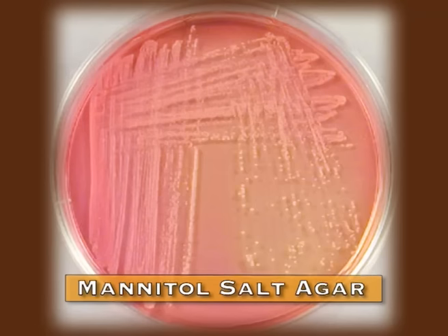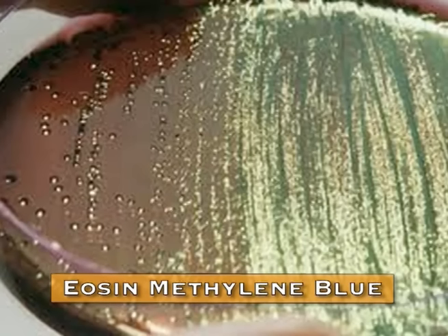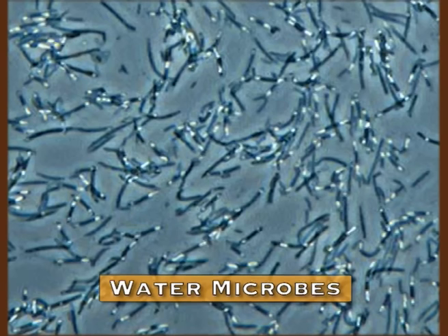Similarly, we have mannitol salt agar which contains a high concentration of salt, around 7.5%, which prevents the growth of a wide variety of bacteria. This type of medium is very specific and is used for the growth of a specific group of bacteria. Media like EMB, that is eosin methylene blue, and MacConkey agar are generally used to study water microbiology.